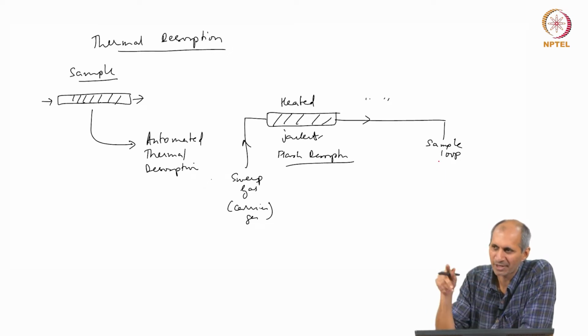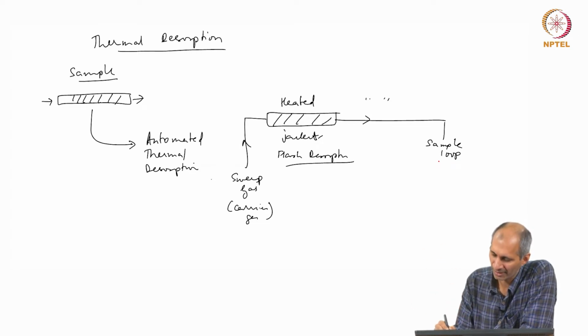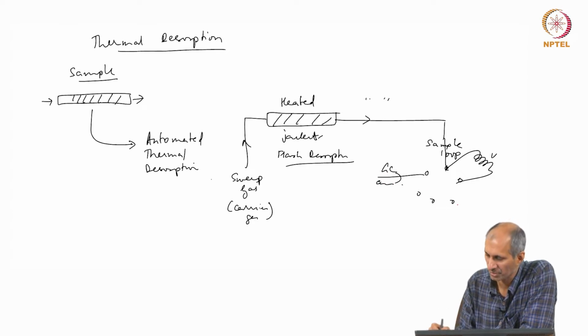You can type GC sample loops and the schematics for that will come. It is a very neat system where there are 6 ports, and the sample goes in, and there is a small loop. This loop has a certain volume, and this is the injection volume. You can have it as big as you want, 100 microliters, 1 ml, whatever. And in the other part of the system, there is a carrier gas coming in from another cylinder, and it goes to the GC somewhere.